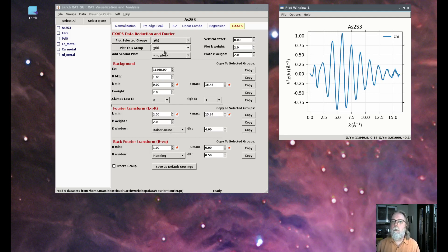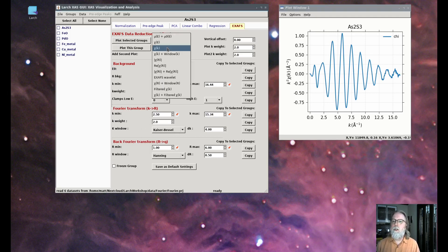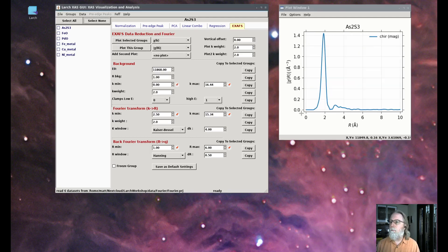If we do the Fourier transform, we can see what the result looks like — a single frequency peaked up just below two angstroms. There's a little bit of a second peak here, not very strong. And then it's pretty close to zero all the way out to 10 angstroms.